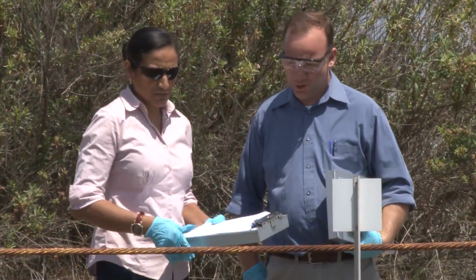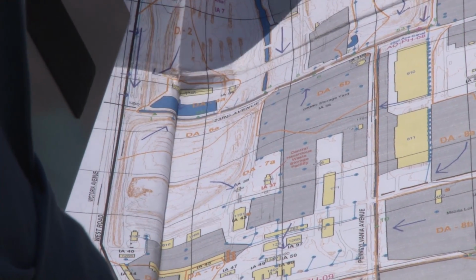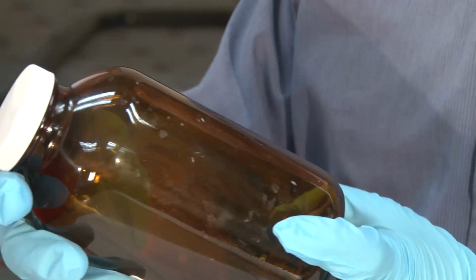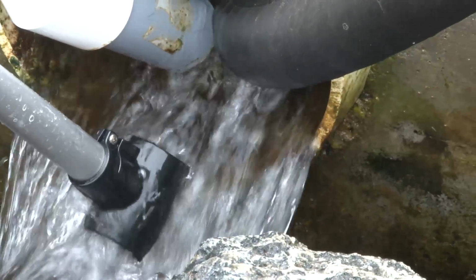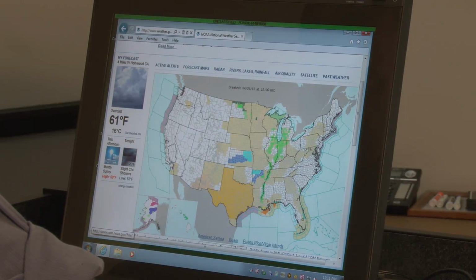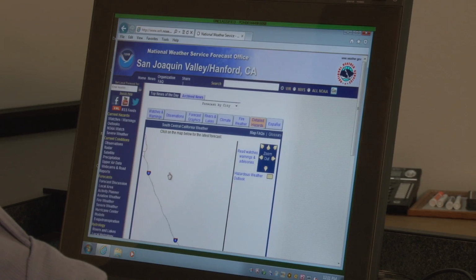Determine sampling outfalls. Then, become familiar with the routes to and from the sampling locations. Obtain and check all sampling equipment. Obtain streamflow data for the sampling location. Refer to the SAP for guidance. Monitor weather reports and predictions. Rainfall for the sampling must be considered typical for the sampling area.